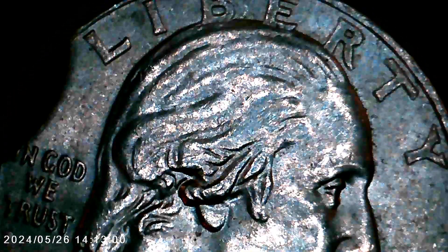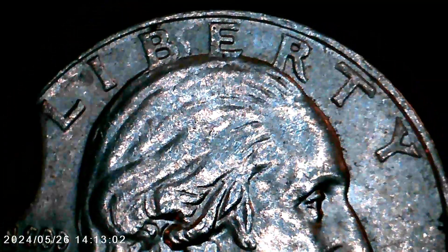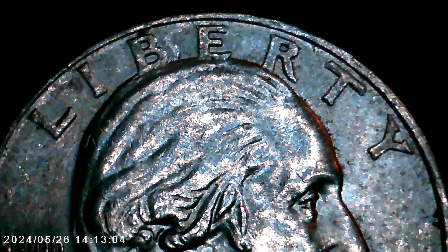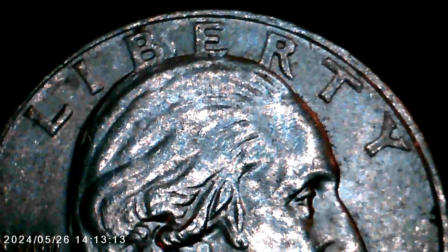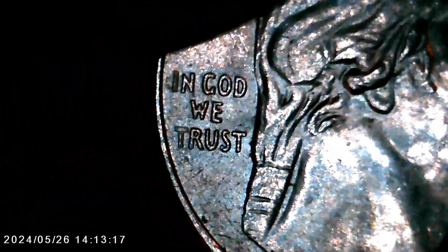So here is video that it recorded onto a micro SD card that I inserted. Here's that same nickel from before. I'm just focusing that and take a look once I get that locked in. Very, very clear focus right there.